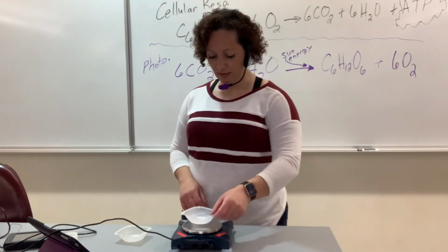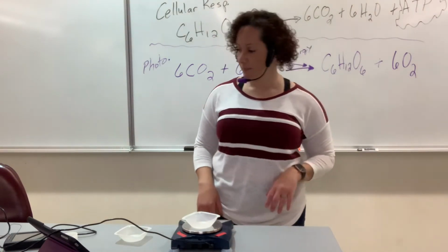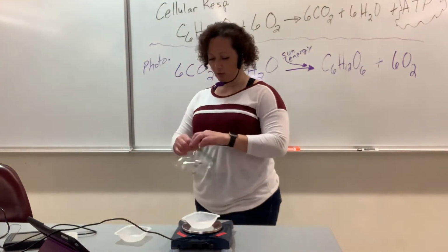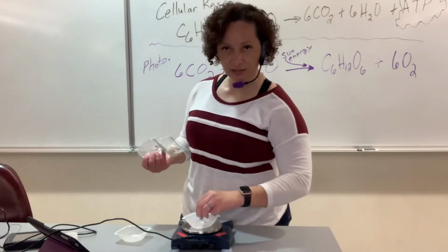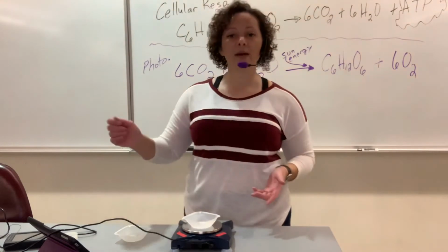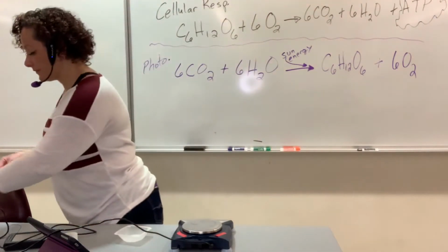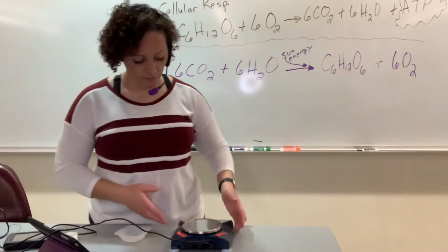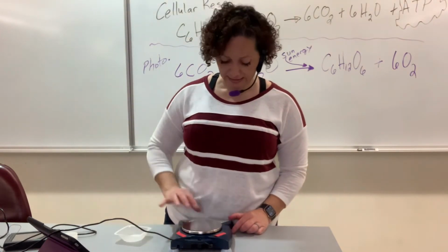Let's get this ready again. Put it there. Let it stabilize. Hit the 0 button. Perfect. Now, you get your plants. Place them on. We'll just let those ones stay on the floor. Place it on your dish. Write down the mass of the plants. Okay? Great, all done. Make sure you write that down and you keep the amount that you have written down.